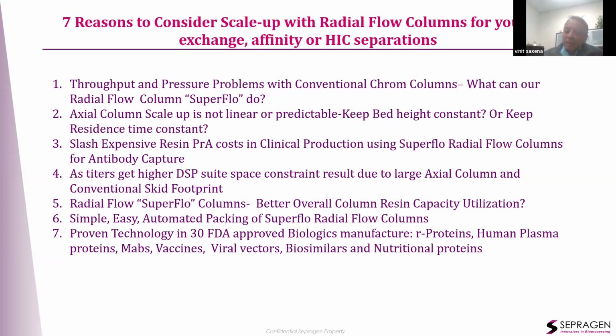And then what about capacity utilization? When you go to larger and larger columns, it's easy to say, well, make the column wider. Well, all your development work is done in little columns like that. But now you go to 1.5 meter column, and the capacities of the resin is not the same. Okay, maybe people say, I'll operate at 80% of the theoretical capacity.